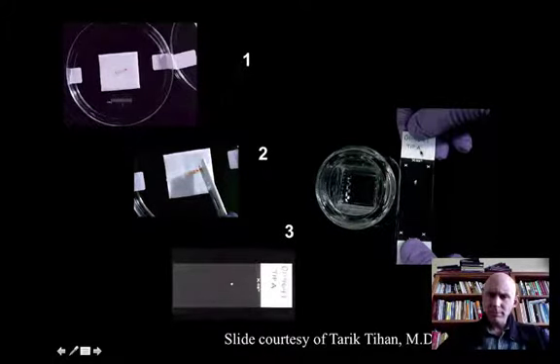The method that Tarek used is slightly different than the method that I use. And I'm happy to show people the way that the cytopathologists at UCSF taught me to make smears. I know some people have good luck in making it in this fashion, but I do not, and I do not actually teach this exact method. So we can take it offline, and I'm happy to show people how to make a good brain smear.